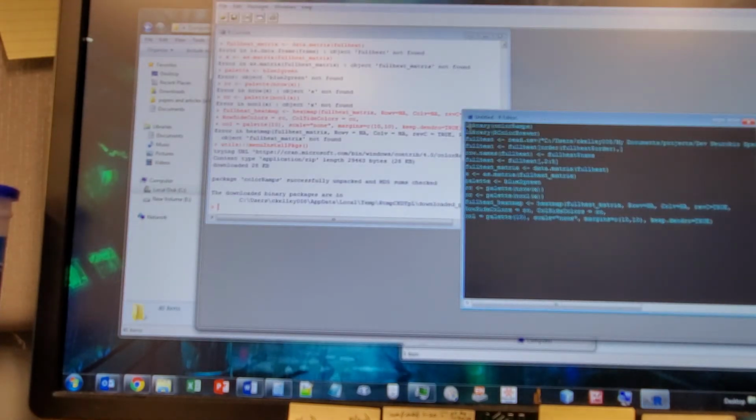Okay, so after you do that, do that for both of these, and then you can just let them load each time. You don't really need this to repeat for each session, but I just keep it in the code because why bother deleting it? Then you'll want to name your heat map something. Here I have full heat, probably because I was doing subsections of genes when I was doing this, so this was the full version.